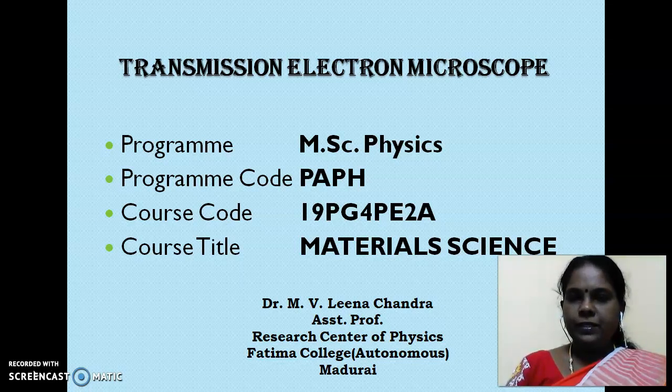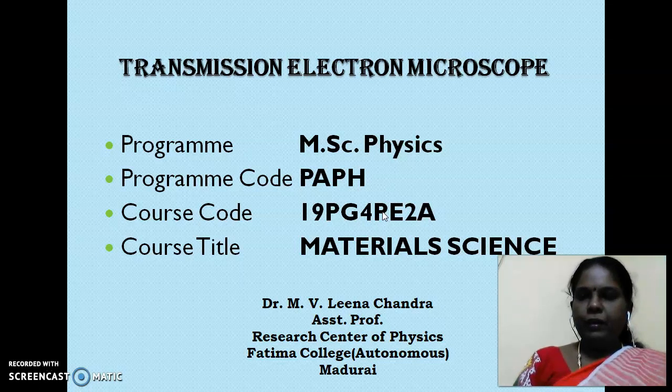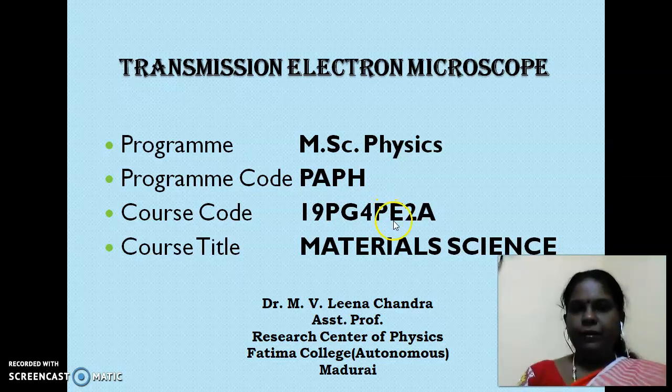I am going to present an e-content on the topic Transmission Electron Microscope from the course Material Science of the program MSc Physics. The outline of my talk is about the introduction of Transmission Electron Microscope, specimen interactions in electron microscope, working of TEM, then parts of TEM, sample preparation and conclusion.